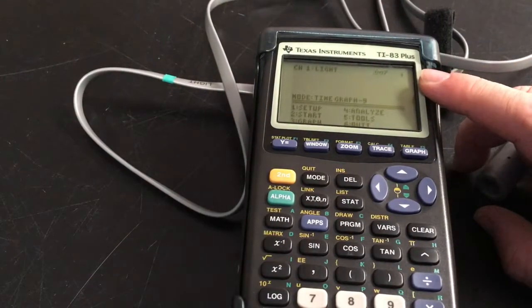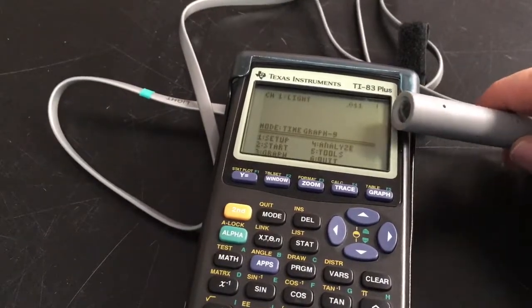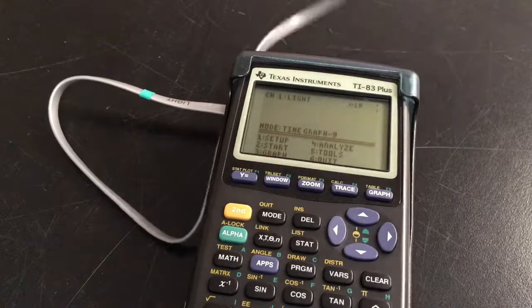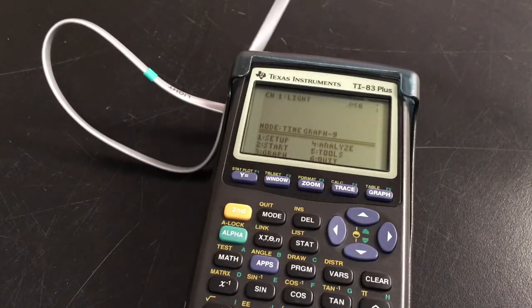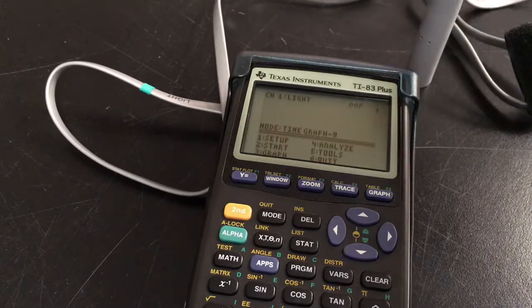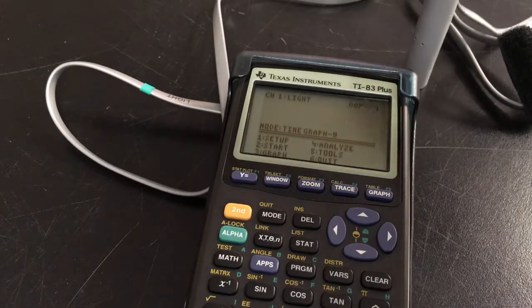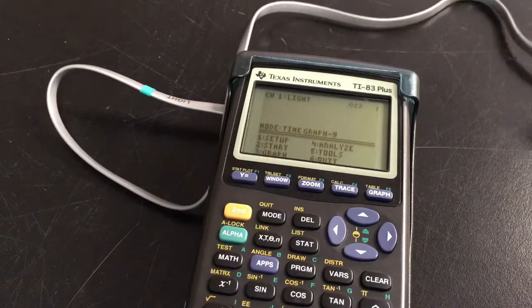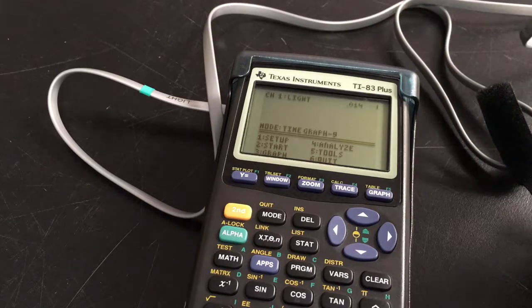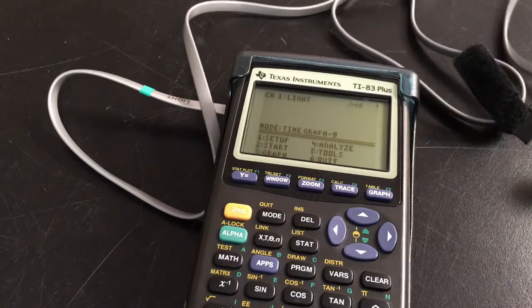So here we've got a light reading. Data probe, data mate, and we're getting a reading up here for our light meter, 0.0012. Okay, when I put this probe at a light, or closer to a light, the number should go up. When I cover it, or point it at the desk, it should go down, and it goes down as low as possible. It's a number between 1 and 0, 0 being dark and 1 being fully light. So we can use this, this is lux by the way, and it's just a value for light ray readings. And we can use that in different experiments.